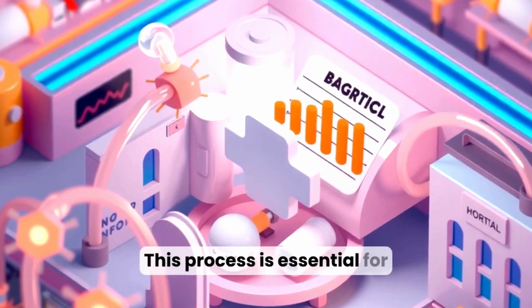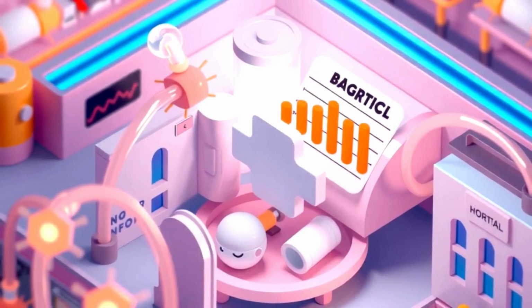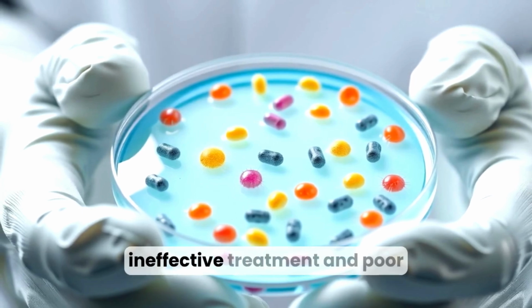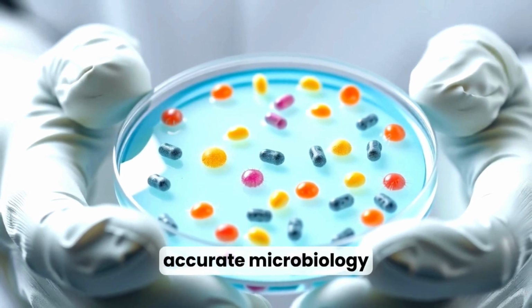This process is essential for diagnosis, choosing the right antibiotic, and understanding how infections spread in a community or hospital. Without pure cultures, we risk wrong identification, ineffective treatment, and poor infection control decisions. Isolation is the foundation of accurate microbiology.